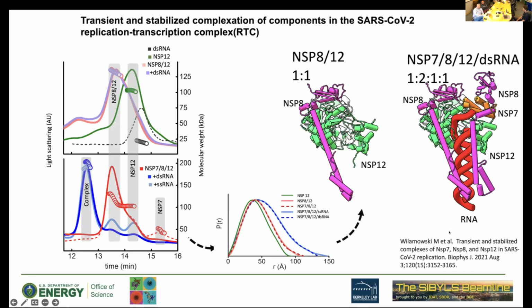So that was also confirmed with cryo-EM, but they didn't have this transient kind of functionality, that the NSP7 is not in place all the time. It just comes into place when the RNA is threading through the hole. And I think that's the last slide.